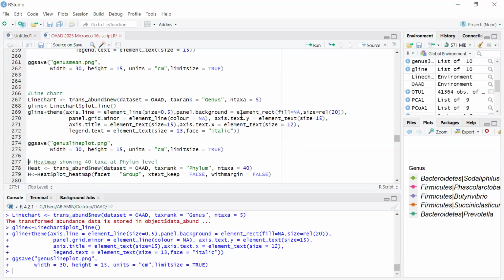It's giving me some kind of error. Oh, it's actually not direct, it's a proxy package. You use the BiocManager package. Yeah, I just checked that out. Thanks. I'm trying to find a way around it now.